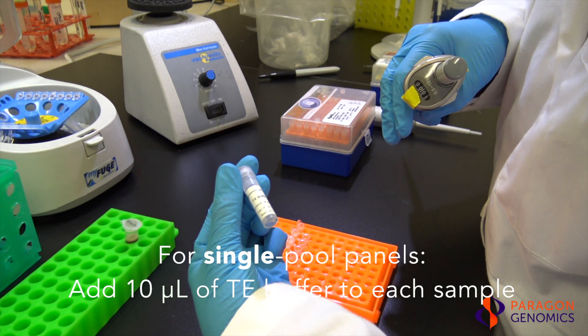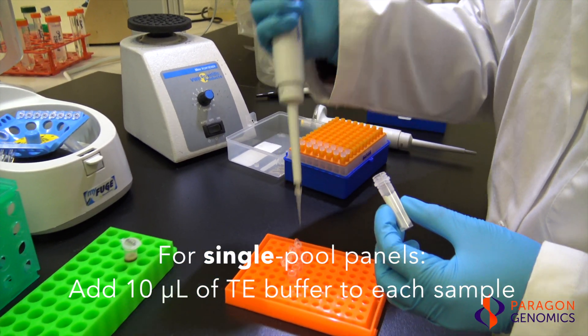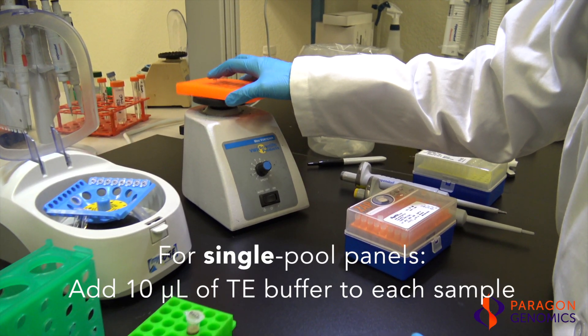For single pool panels, add 10 microliters of TE buffer to each sample to get a total volume of 20 microliters in each tube. Vortex and quickly spin down the samples.